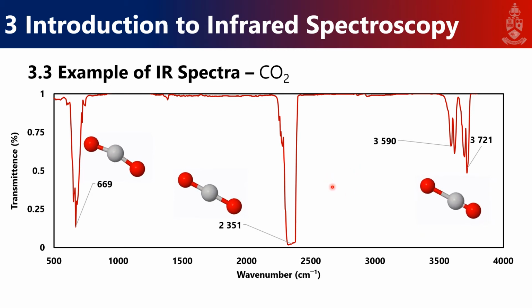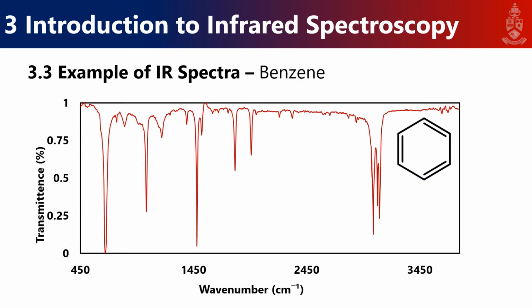But how is this at all useful, really? And how do we even know it looks like this? So this is computationally designed. I didn't thumb suck it and know how these molecules work, or how they wave or vibrate. But essentially, how can we use the spectrum to help us identify molecules or complexes, or at least ligands within complexes? Right, so that's our big question that we will discuss with a bit of a more complex example. And our more complex example is benzene.